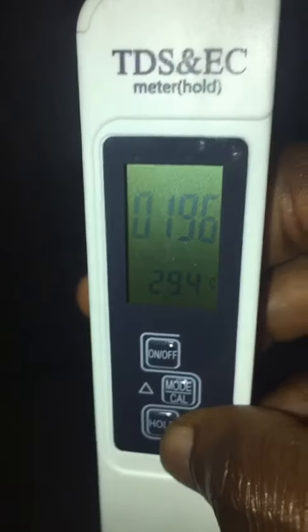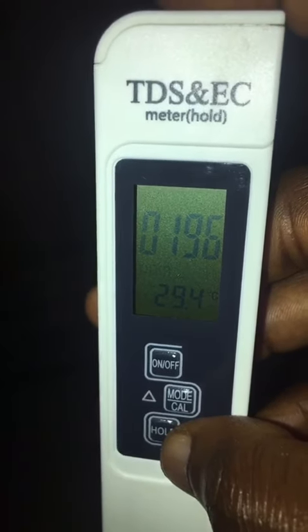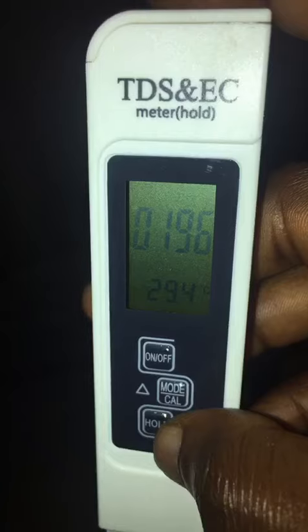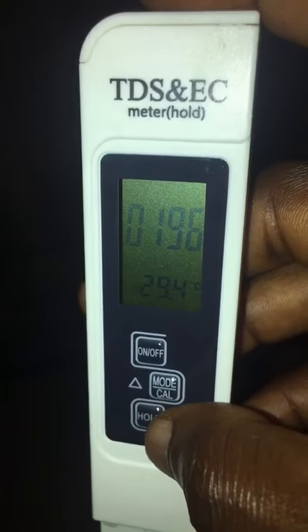The reading has stabilized. As you can see, TDS is 196 and the temperature is 29.4 degrees centigrade. If you want to check for EC, press mode to switch to EC mode.